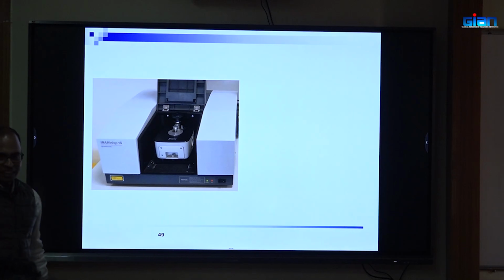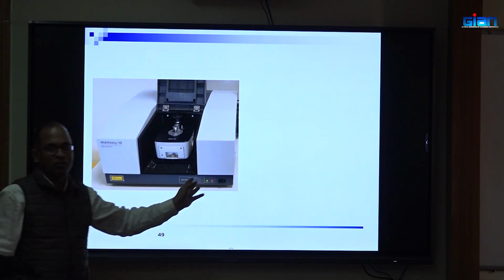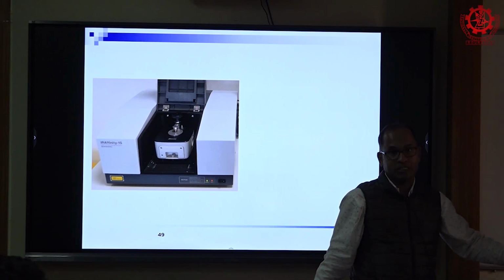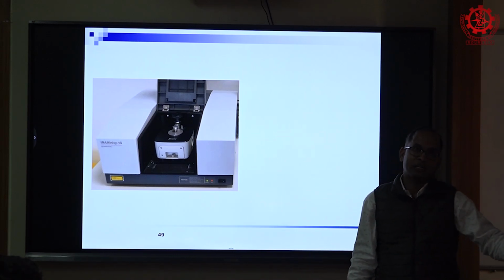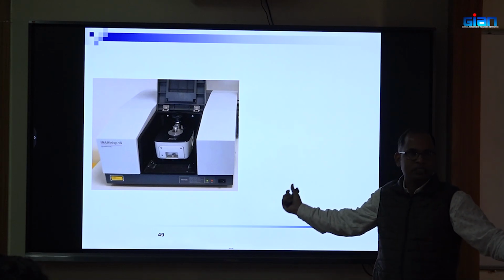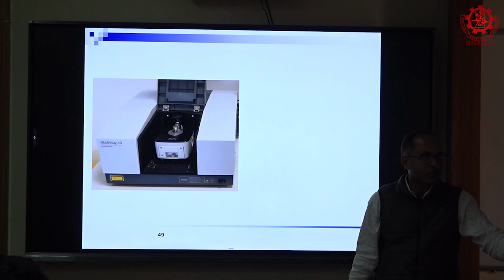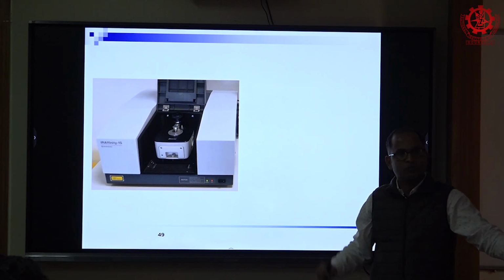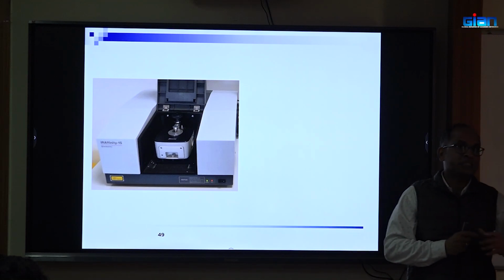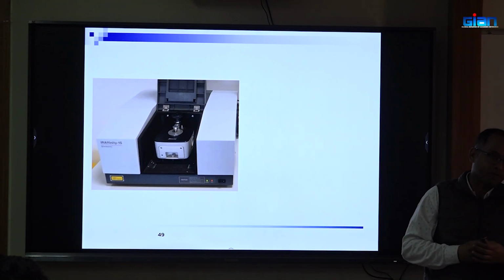Okay, so I think then we can move on. I really did not want to discuss all this, that is our chemistry people's job. But this is how you can perform the IR scanning and analysis. Of course, this analysis is based on your understanding of the IR spectrum, but once you understand, you can interpret the spectrum efficiently to get the compound.